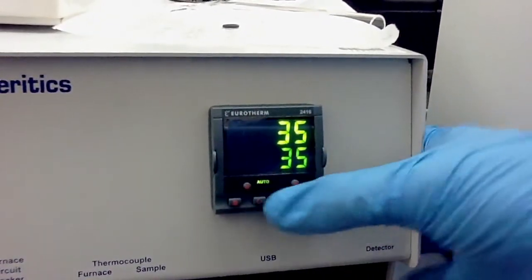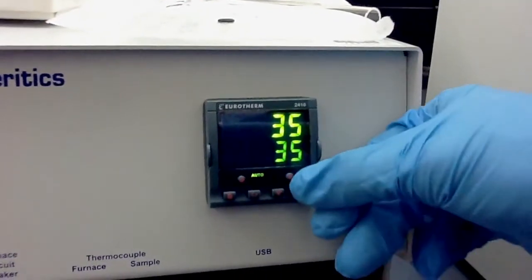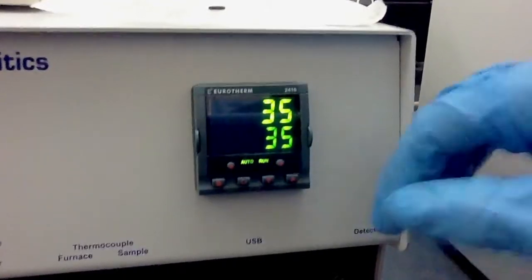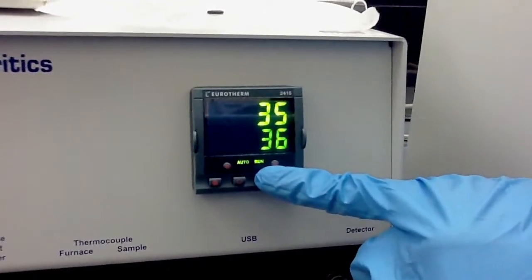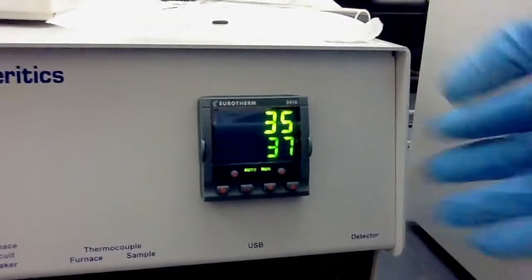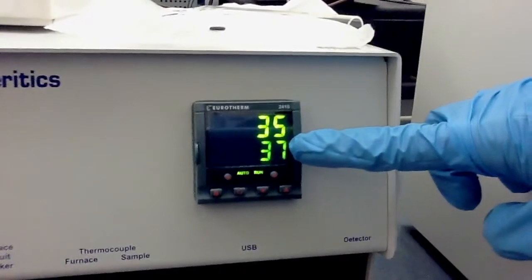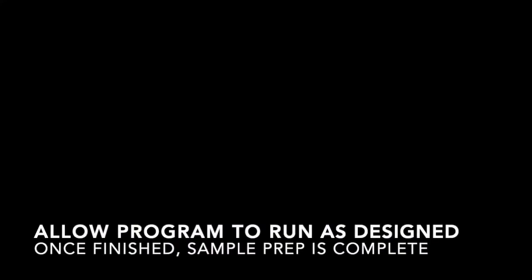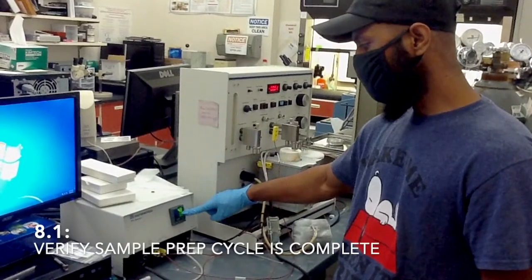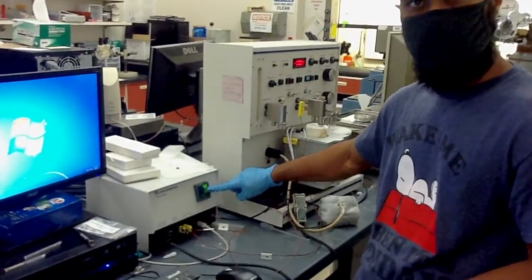So now there is another 2 button here. This button we use to run. So once we press it here, you can see that this run is turned on. That means this program is already running on, and you can see that it's ramping up the temperature. After 1 hour 30 minutes, we came back and we saw the temperature drop down to almost room temperature here.